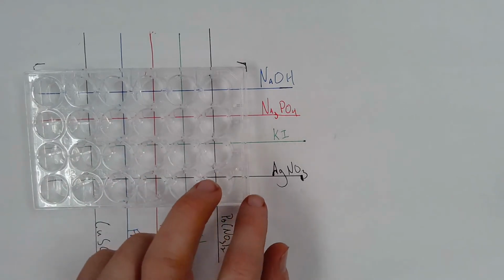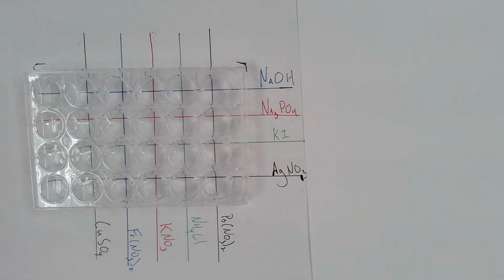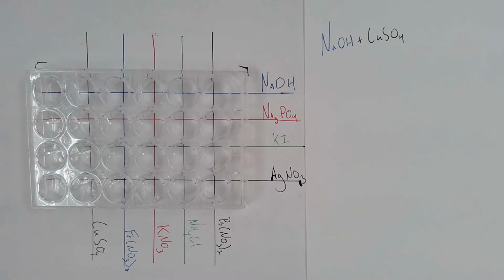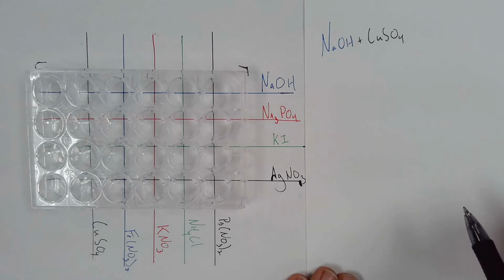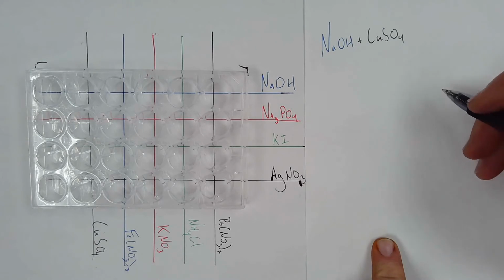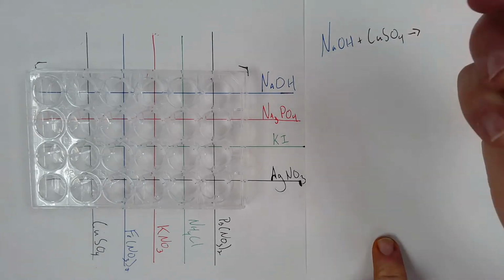So, I don't know, my thought is let's start in this top corner here and work our way down, right? So in the top over here, we're going to have the reaction between sodium hydroxide and copper sulfate. Let's take a look at this. So I have NaOH. Great. Now this is what kind of reaction? All right, so I'm going to put the solubility rules on the picture here in a second. But first we need to make a prediction about what this is going to make. So I'm not going to make you predict this one. I'll predict it with you or for you.